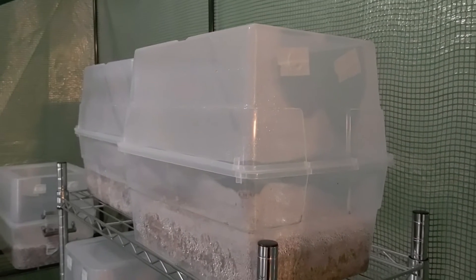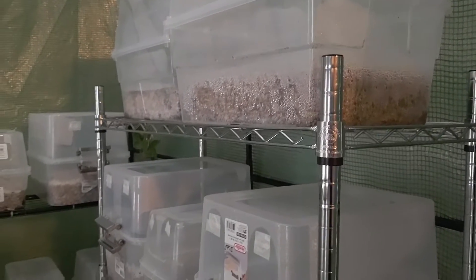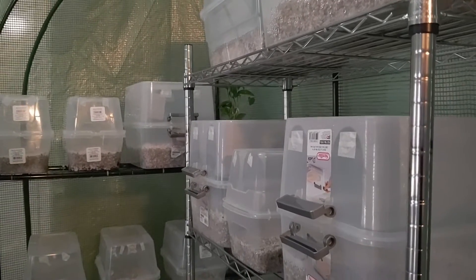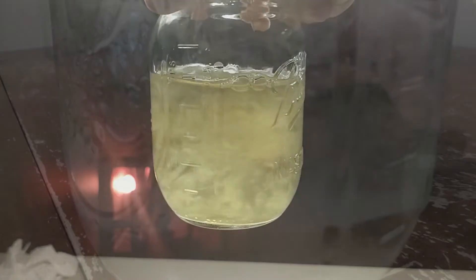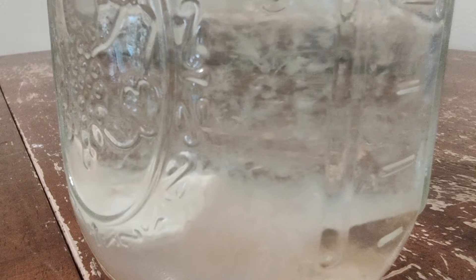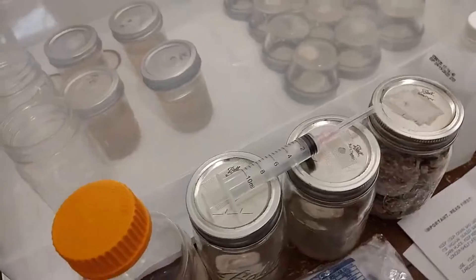Welcome back to Mycology Exploration. In this video I'm going to cover how to grow mushrooms at home from start to finish. It's going to be informative and you have a lot of choices, and I want to go over all those choices with you. It doesn't matter if it's gourmet or medicinal — when it comes to the type of mushroom you might have to tweak a few things, but this can be used for all types of mushrooms.